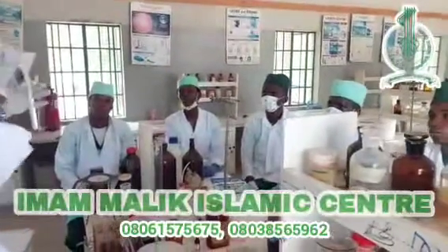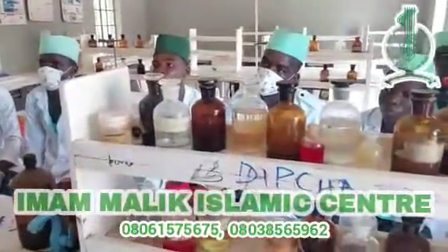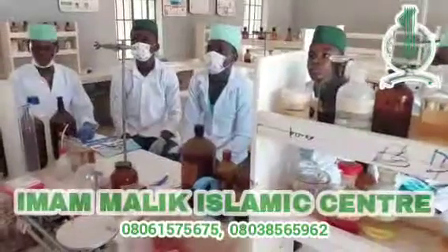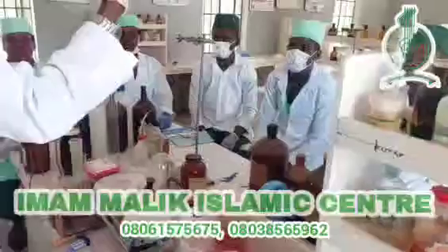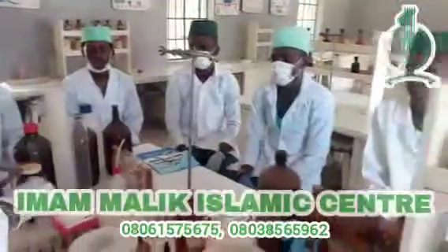Because as a chemist, when you want to perform any experiment, even if it is a drop of the sample or the reagent, you don't need to waste. Exact and precise volume must be taken. So to avoid any error in taking the readings, you have to use funnels for transferring the liquids.